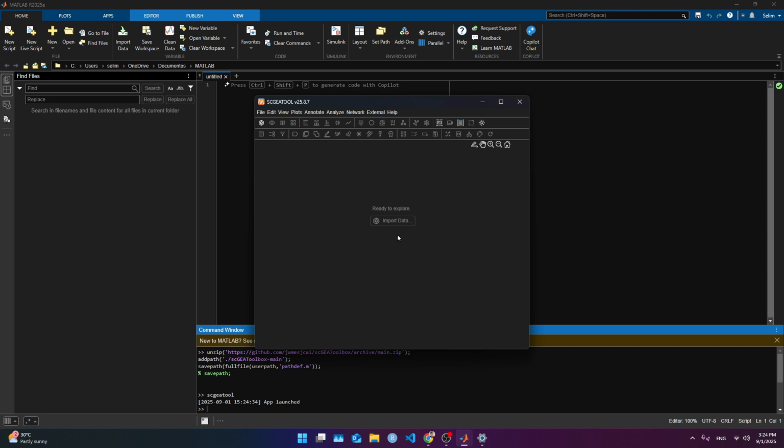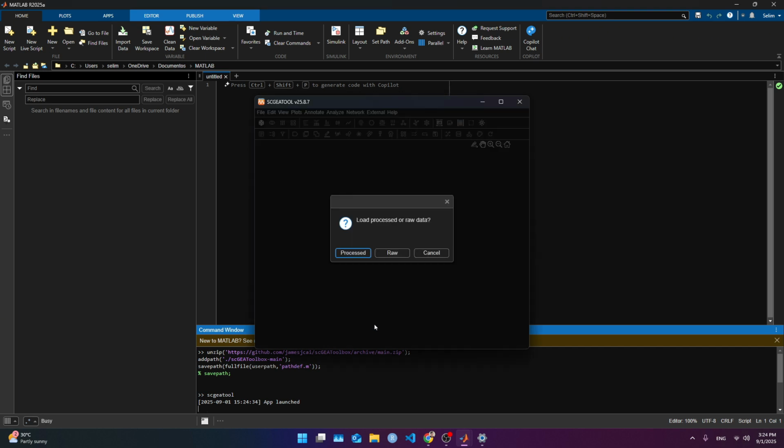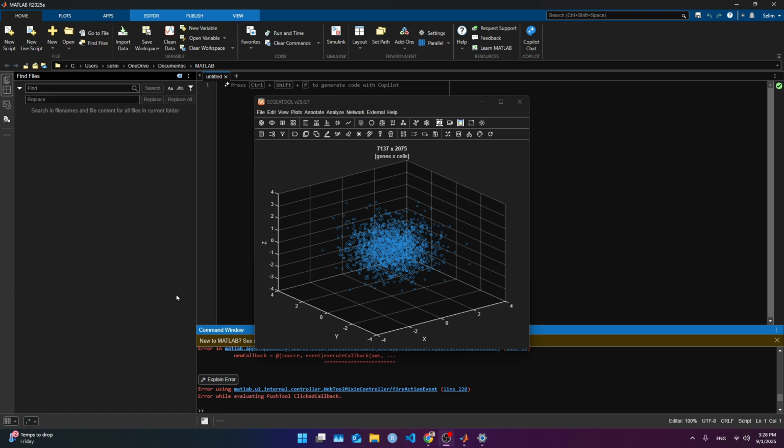So we do import, and we're going to try the load example, and we're going to use the row just for the first test to see that everything is functional, and we're going to look for the 1, 2, 3 button. So that should be in here. Okay, I couldn't find the 1, 2, 3, 4, 5 button. So we are going to do it one by one.